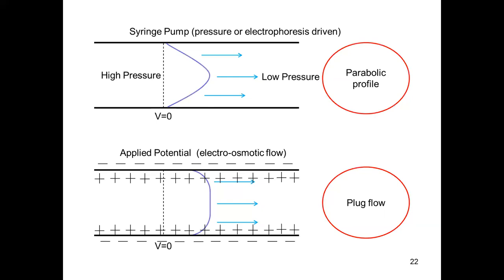A few things can be done on a piece of paper, back of the envelope approximations, like all engineers do for all applications. But this is very, very complex. Fluidic flow on the macro or micro regime has a tremendous amount of variables. So the approximation of fluid flow and how these things actually work is often done by software packages on costly computers that have a lot of computational ability, because this is so difficult to ascertain because of all the variables. In this introductory, overview presentation, we're looking at back of the envelope calculations.